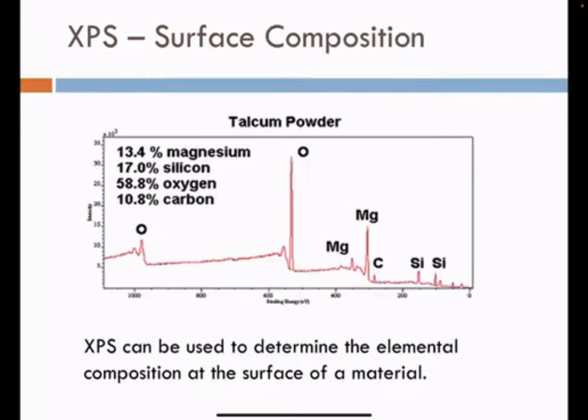shows the characterization of talcum powder, or talc, that can be added to plastics. This is the XPS of the talcum powder. It is added to plastics for easier processing, a bit of slip, and lower processing temperature and pressure.